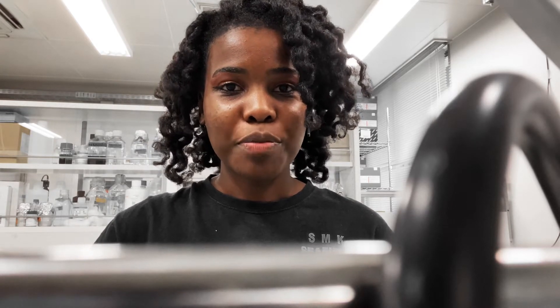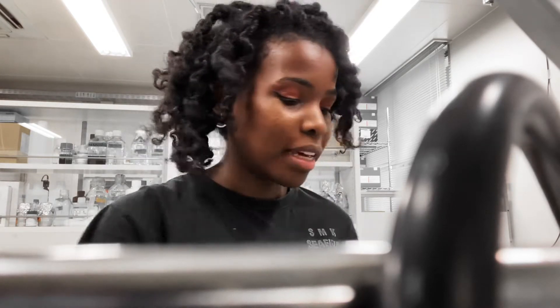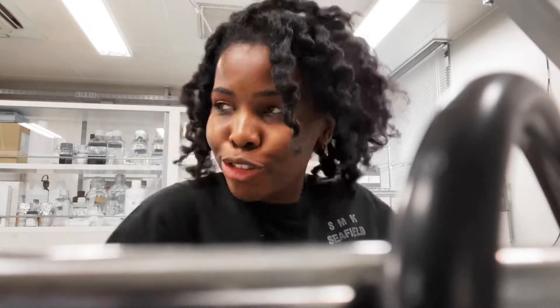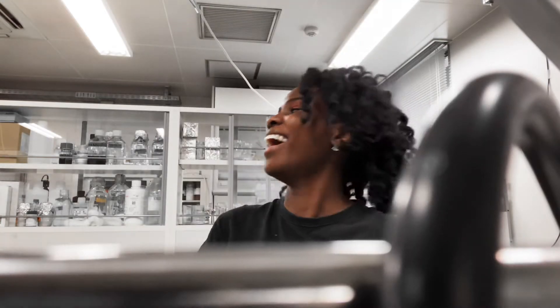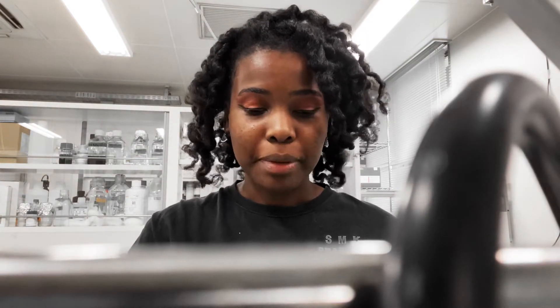Hey guys, I am coming at you from the lab. I just wanted to make a quick video showing you guys what's on my bench. I don't know, maybe this could be like a thing that other PhD students or graduate students do.